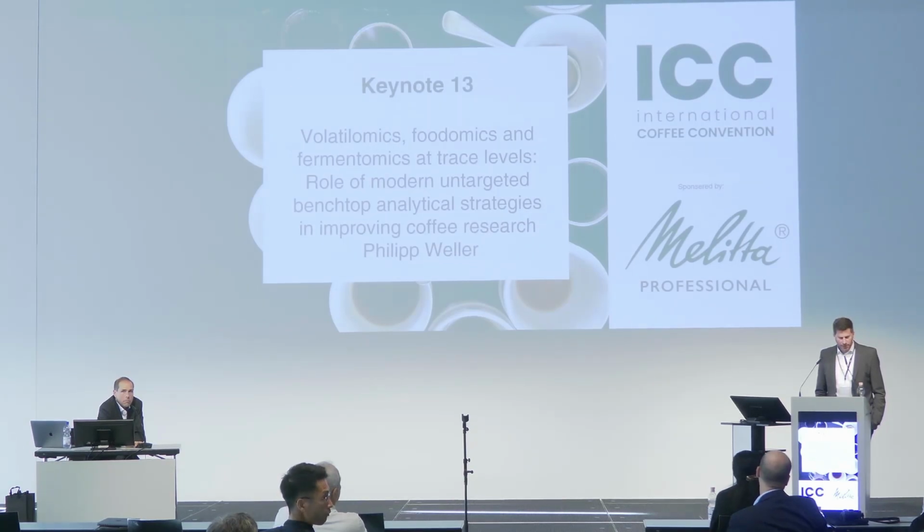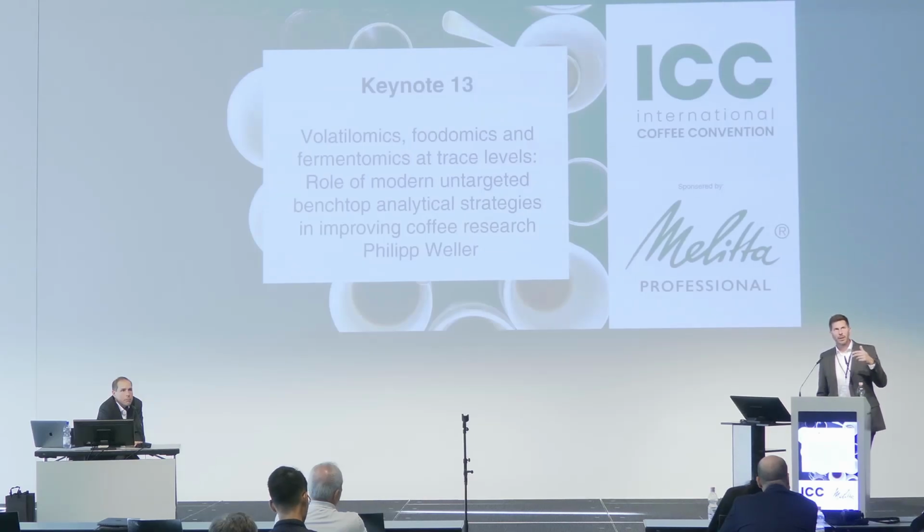What I can say is that in a different field, we're doing citrus juices and oils as well. Part of the terpenes show oxidation very quickly. But the oxidated species are difficult to detect with classical technologies, because they just break down and show the same fragmentation pattern, which is really difficult to interpret. In this case, we see oxidation artifacts, depending on the storage, like light exposure or air exposure of the oils. We see quality diminishing in very early stages. And let's put it another way: if you smell or have a different impression of the taste of the coffee you refer to, I'm pretty sure we will see that.